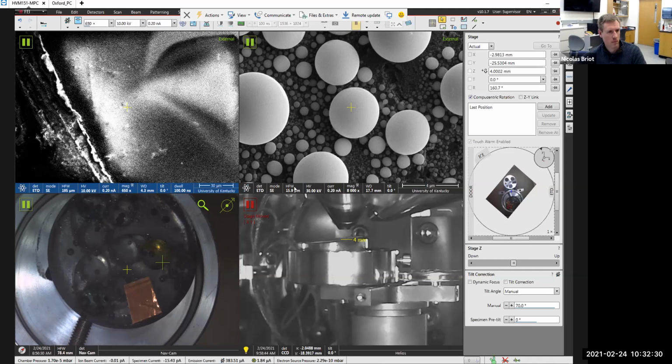Two of them have 5% silver, and then one of them was in the 5% silver and potassium, but it turned out clear. So the glass composition may be different on that one. Okay, yeah, I see that one. That's what I would try. Let's just replace the sample and put the rod directly, and then we look at it, see if we see something.